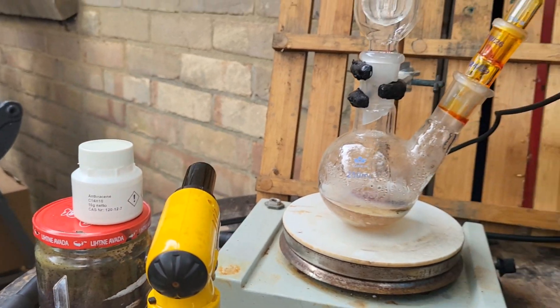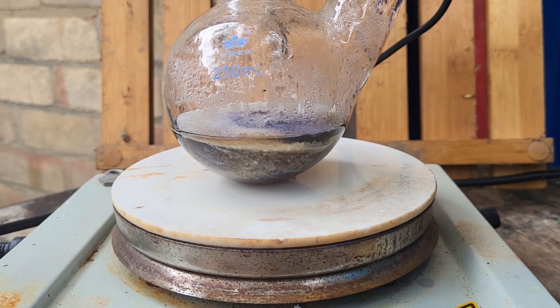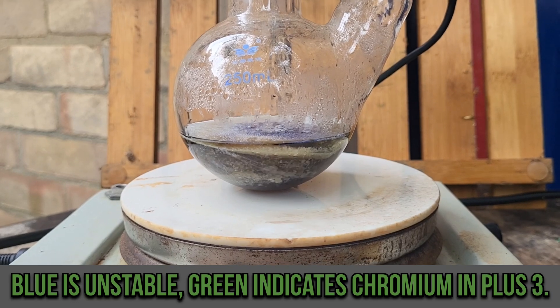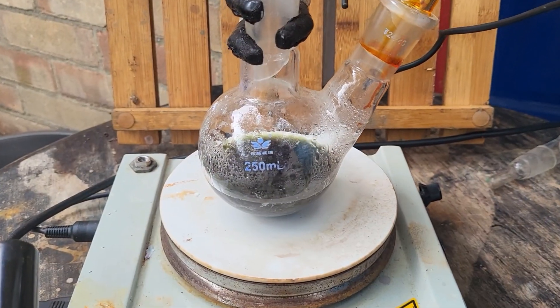I haven't even turned the stopcock yet but there was some reaction. Look at that blue color — I was expecting green. It is a bit green. Yes, it's green now.